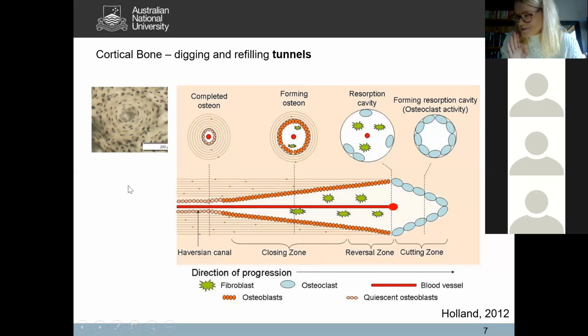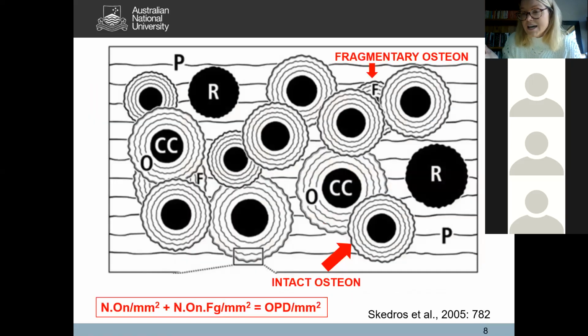So this was in about 5 minutes. I guess that's probably the most important thing for you to take away in such a short session this morning. And that's why it's really valuable to us in biological anthropology and in any other area that deals with skeletal biology and particularly bone histology. It's essentially a reflection of your bone remodeling activity.